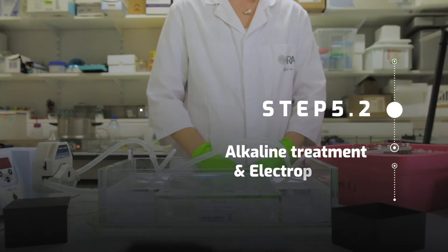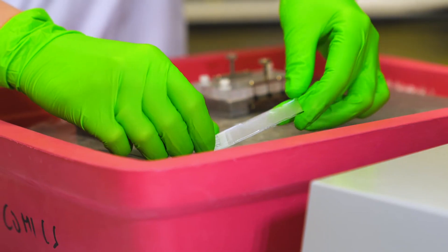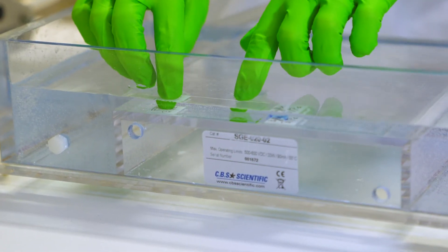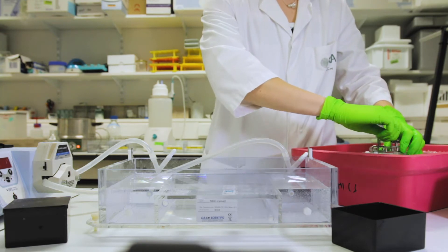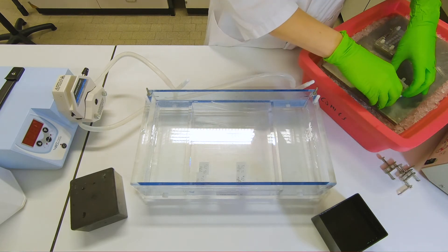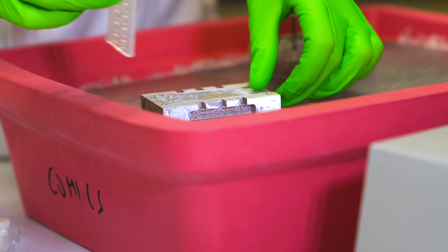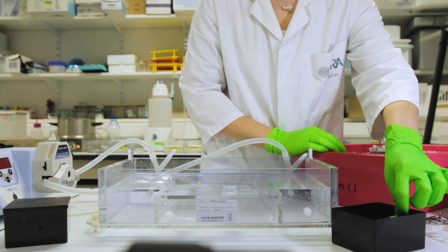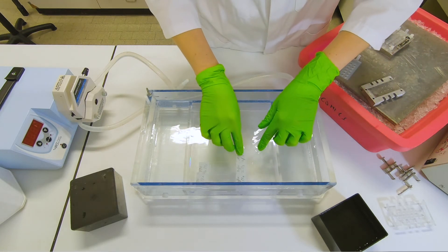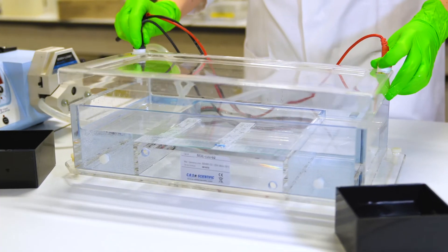After incubation, all the slides including the 12 gel units are placed on a metal cold plate. Remove the cover slip of the slides containing two gels and transfer them to the electrophoresis tank already filled with electrophoresis buffer. In the case of the slides containing 12 mini gels, remove them carefully from the 12th unit and quickly immerse them in electrophoresis buffer before transferring them to the tank. Perform the alkaline treatment for 40 minutes and then switch on the power supply.